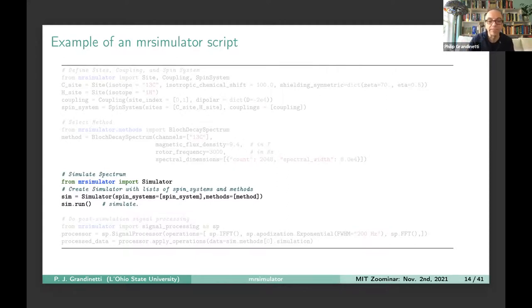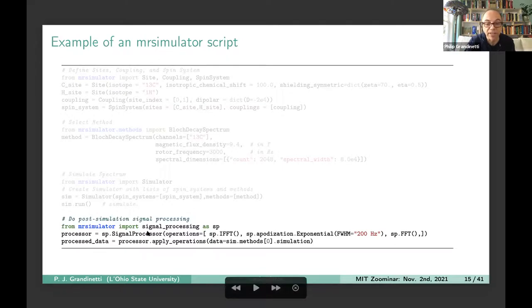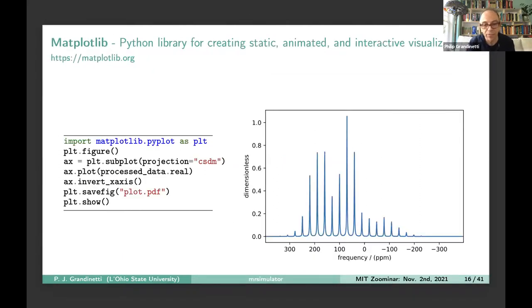Now, generally speaking, you might want to do some post-simulation signal processing. Maybe you want to apply line broadening. So we have a signal processor object that you can bring in and create a list of operations that you might want to do. And then you create the object and you just apply it to the simulation that's attached to the method and you're done. And that's in one sheet there. You can see all the script you would need to do that simple example of a carbon-13 attached to a proton spinning at 3 kilohertz. And then with Python, the cool thing is that you can leverage all of these pre-existing packages.